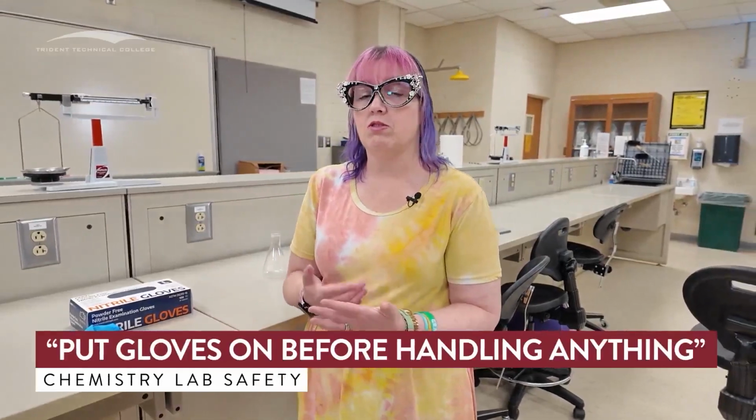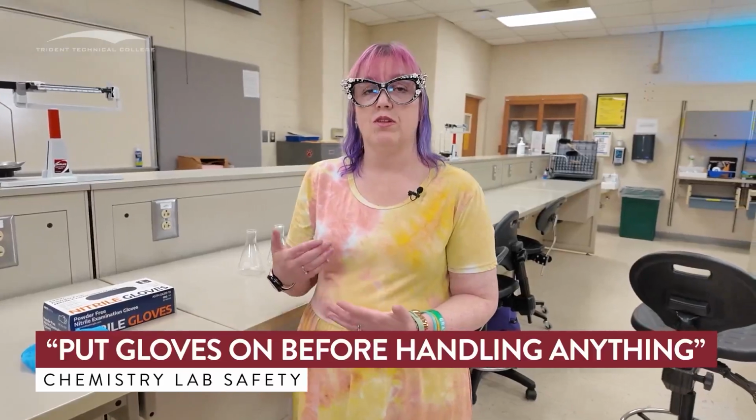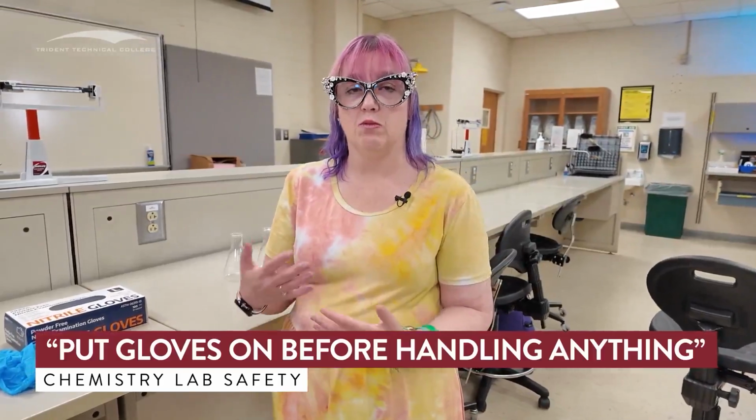Now, things that we need to make sure of when we talk about these experiments. We put those gloves on before we handle anything, because you may not be the first lab for that week. So the things that we're dealing with may not be as clean as we want them to be. So we want to make sure that we're dealing with everything in gloves. Anything that we deal with in the lab needs to be done that way. Anytime anybody is working with anything, doesn't matter if it's chemical or not, for those labs, we need to be wearing those gloves. Okay? So I think that's everything I need to talk about with the gloves.